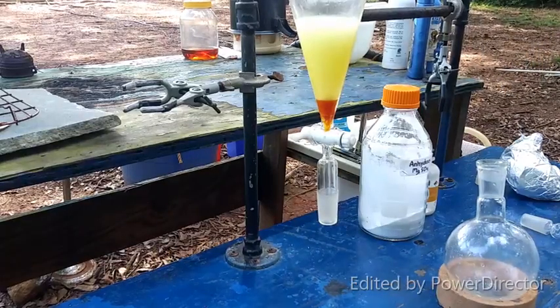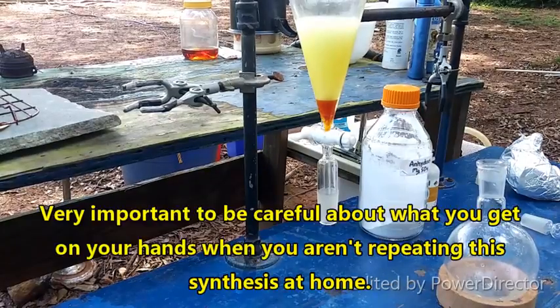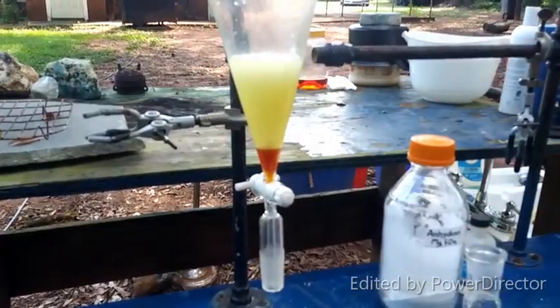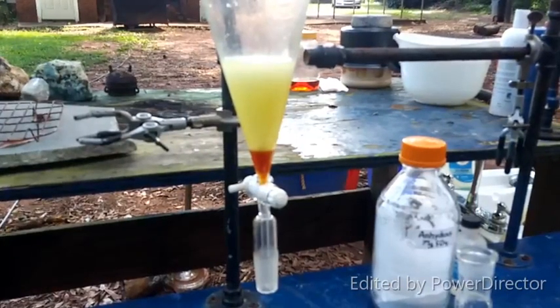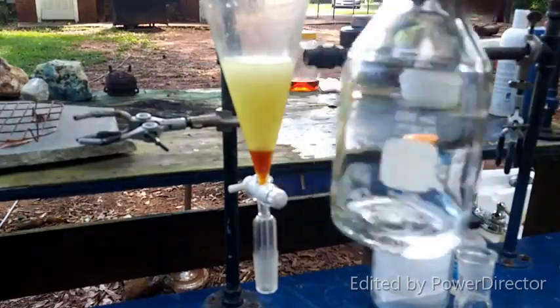Since this stuff is essentially liquid cancer, don't get it on your hands like I just did. Okay, so you can see that's our product, and you can see we've got little droplets of it. Cool. The next step is to dissolve our product in some ether. I have just under 100 mils here that I've distilled out.